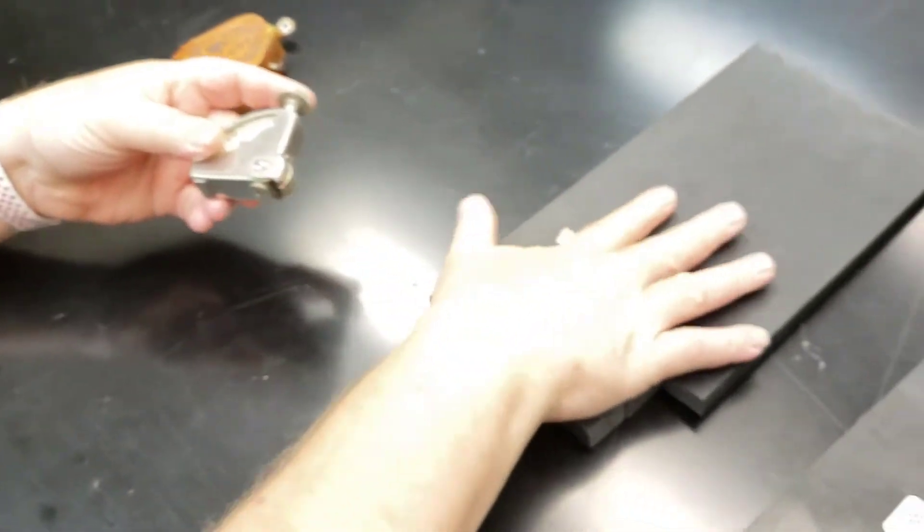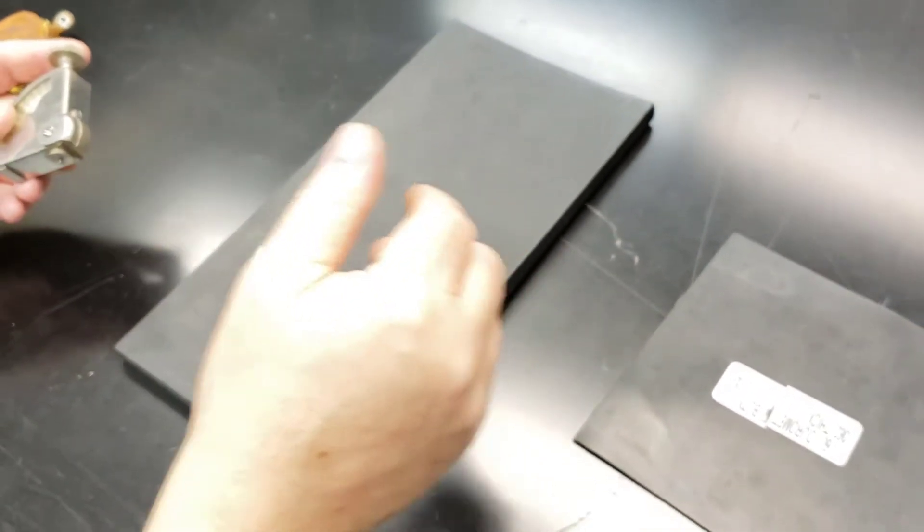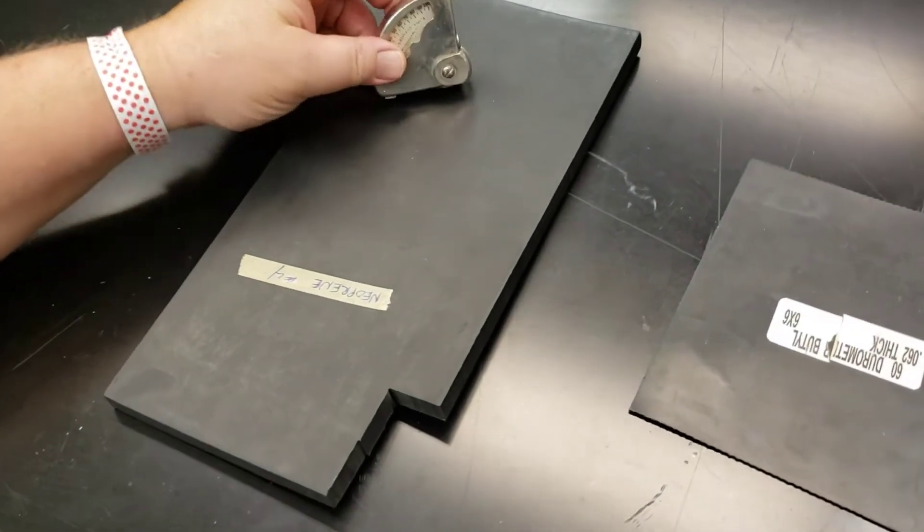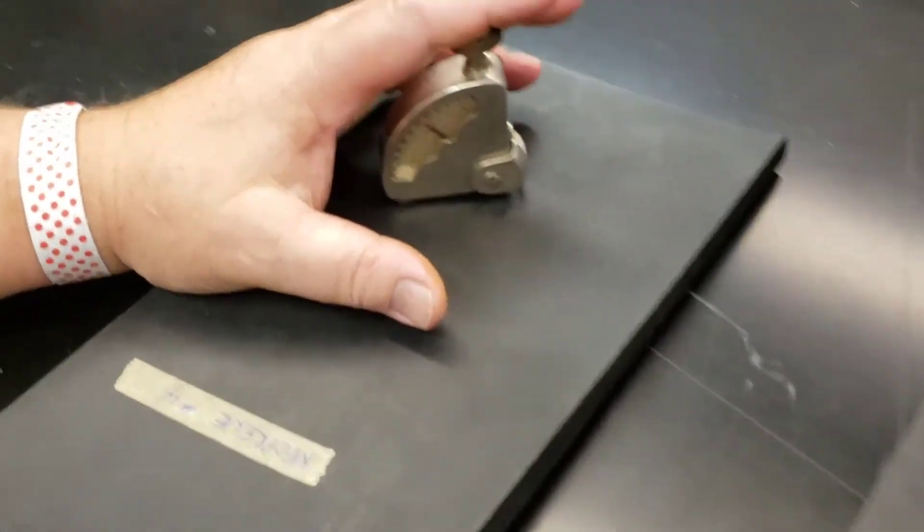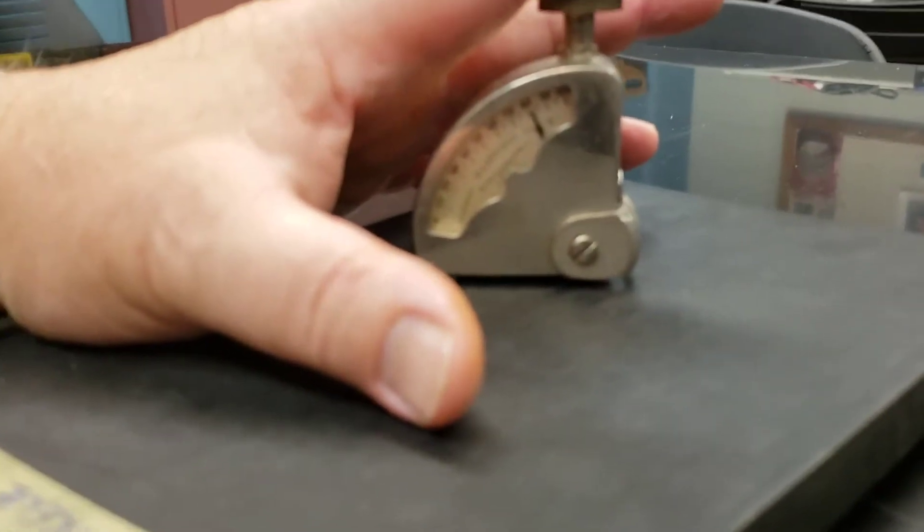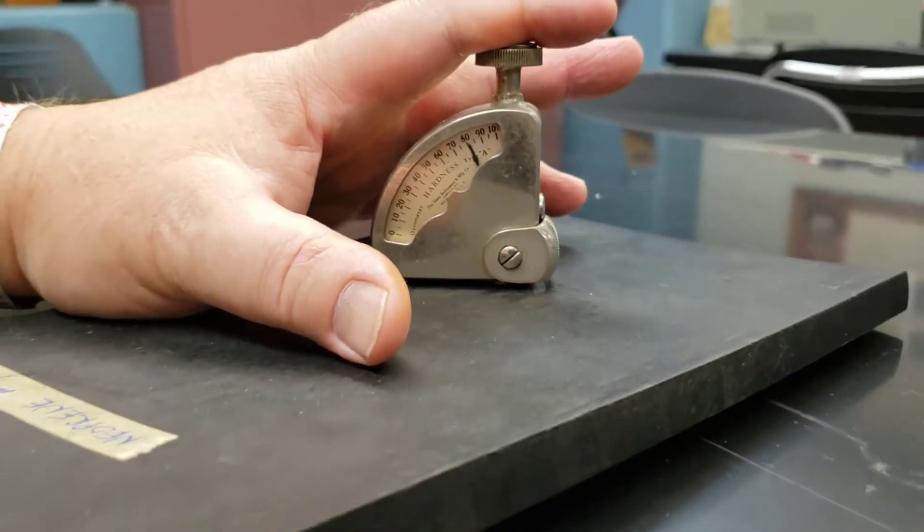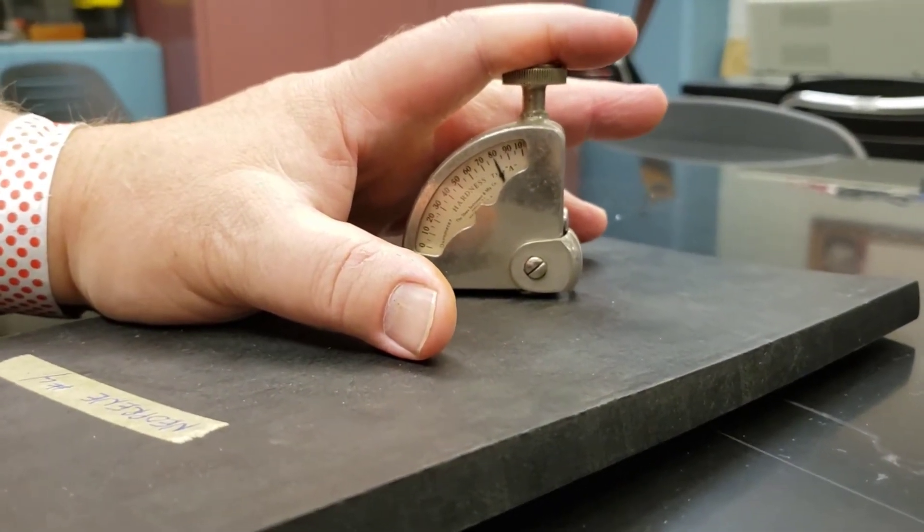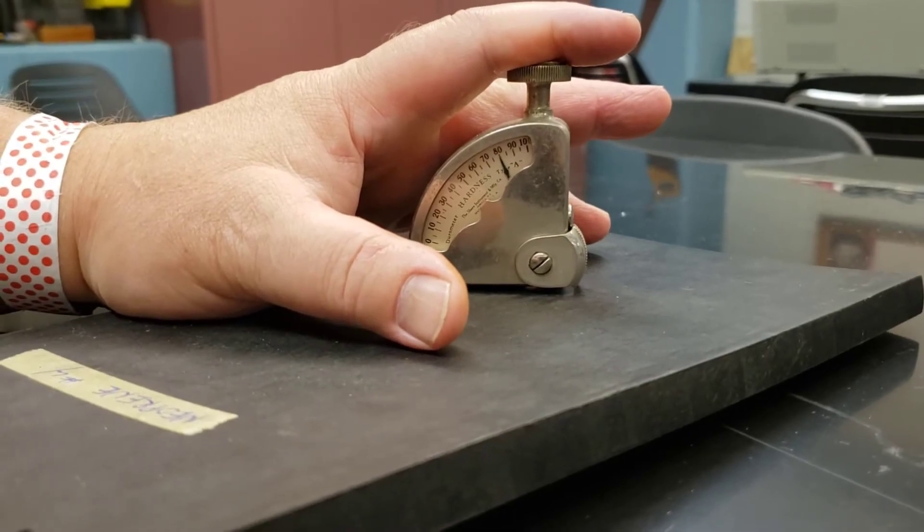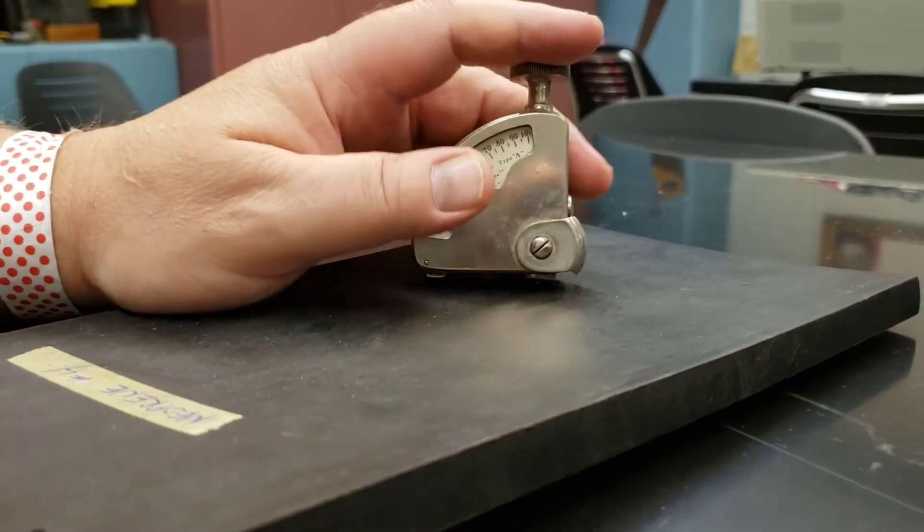So when we go to measure say this nice piece of neoprene, you set it down, we press and I can see that has a shore durometer reading of about 80. And you let go.